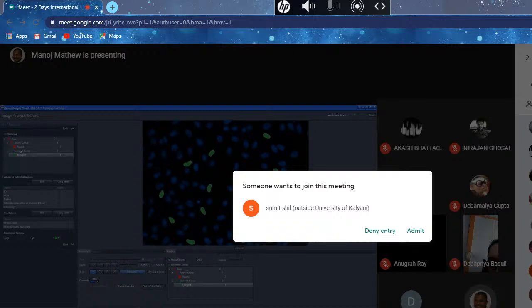Now, as I was saying, I can also do measurements on the group. So in this, let's say frame, I see, I don't know, 20 objects. So what's the total area of all the 20 objects? Right? What is the total area fraction that it occupies? So these are some of the questions I can ask for the group as a whole, right? So I can do some measurements for the group.